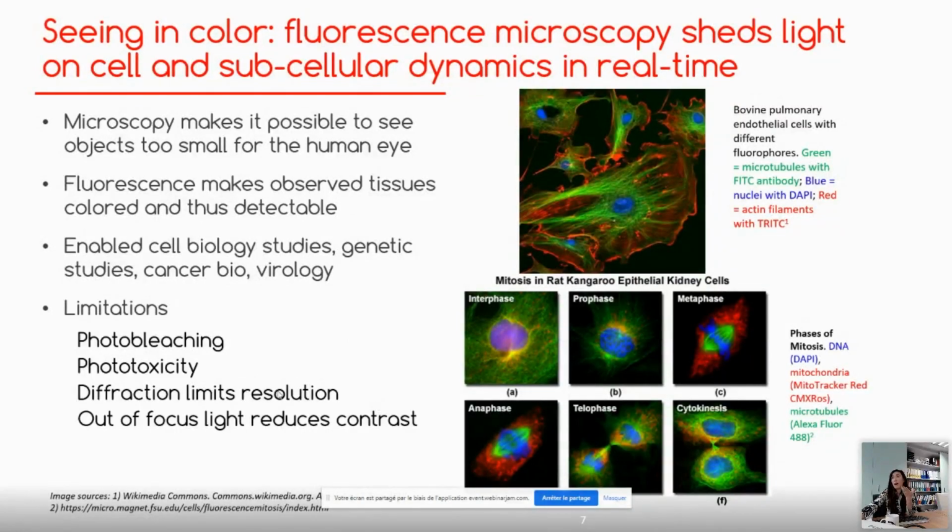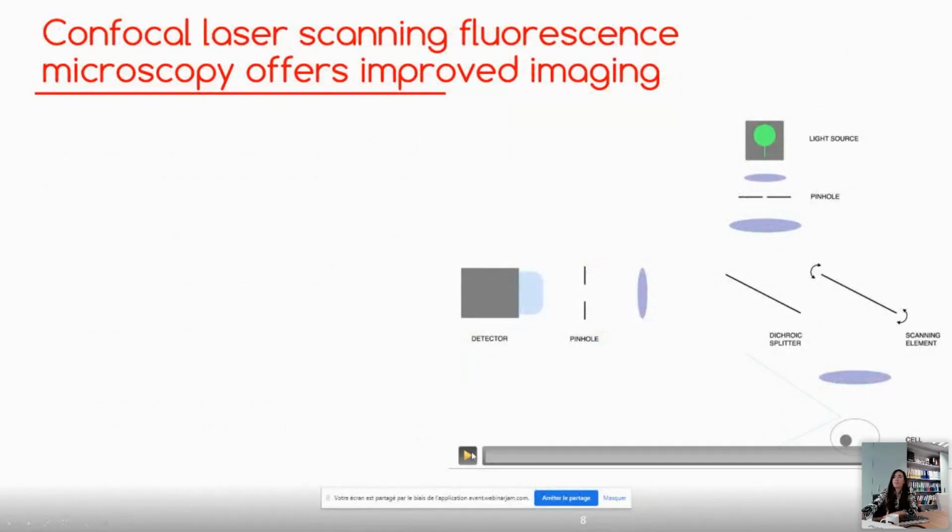And finally, in the wide field microscope, as I mentioned on the previous slide, the light floods the whole plane. So we're not just seeing things that are in the immediate focus, but sometimes we also are getting light coming from the same structures, but they're just in a different plane. And that can reduce our contrast and make things look a little more blurry, or make it hard to identify fine structures as well. So the confocal microscope was able to really significantly address that final point.